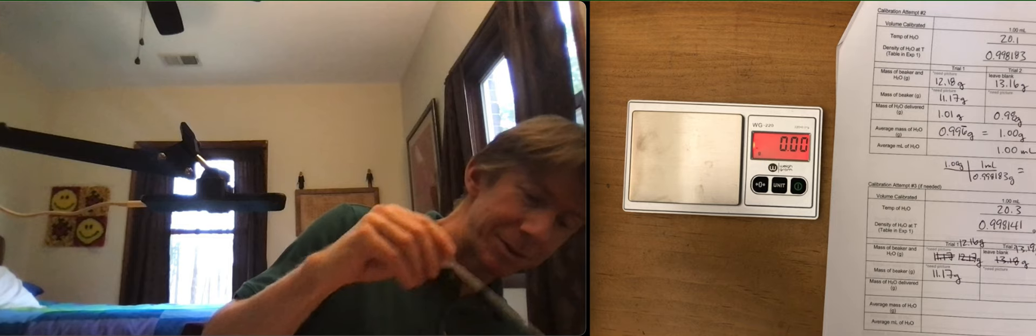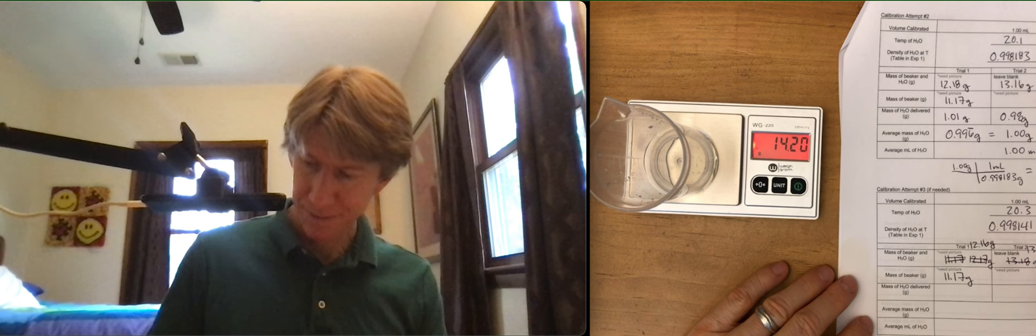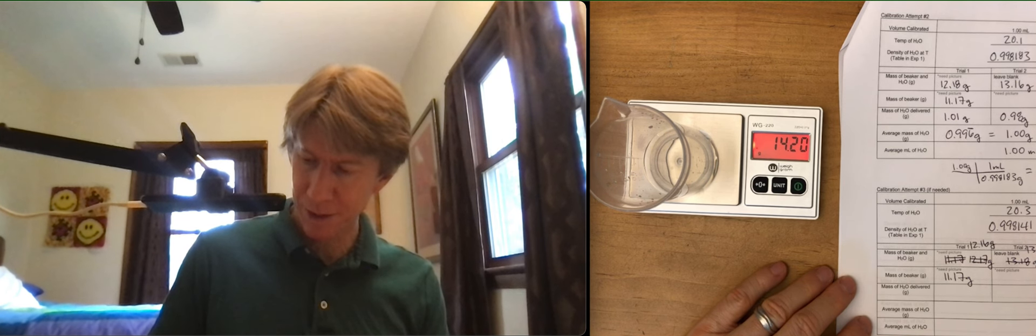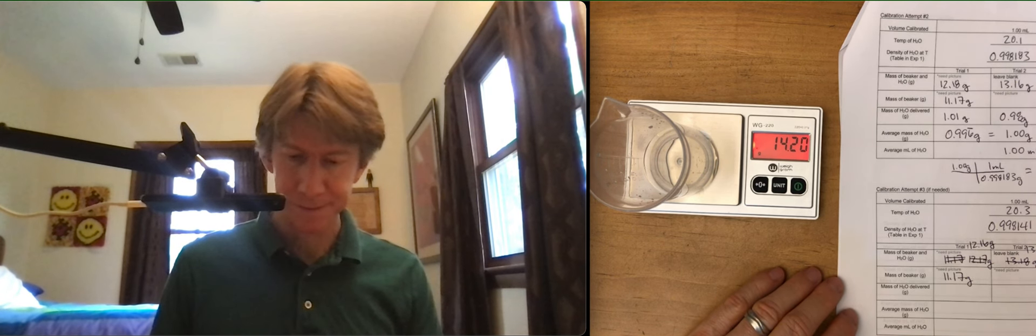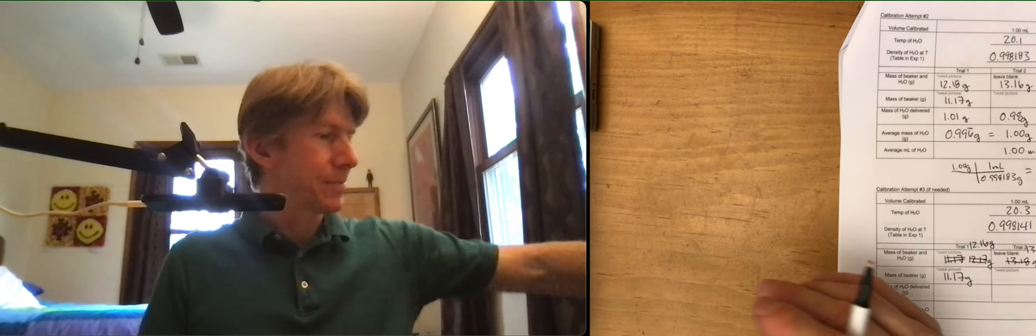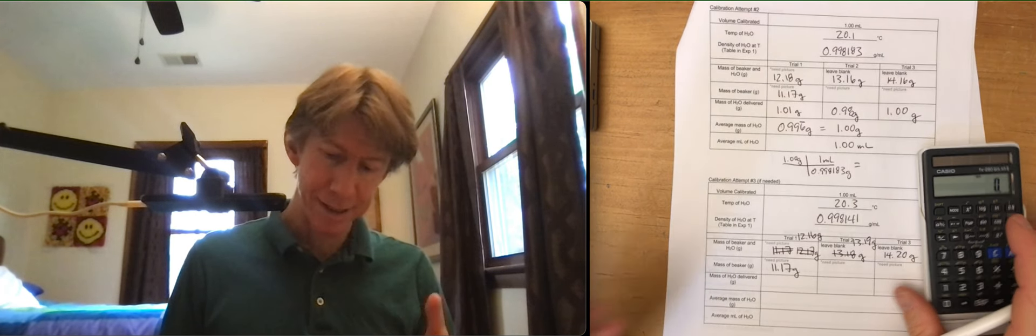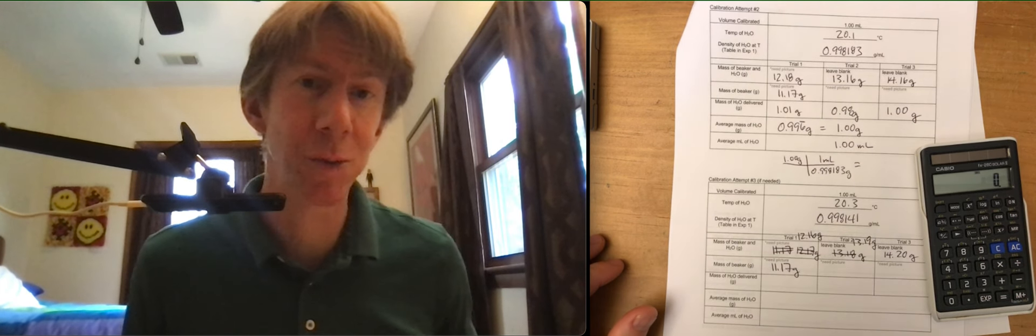Hopefully this will be close. 14.20 grams. Put that in the waste. Do our math again. And honestly, I can tell you this is going to work out. And I have my measurements that I need. So this is where I'm going to end this video.